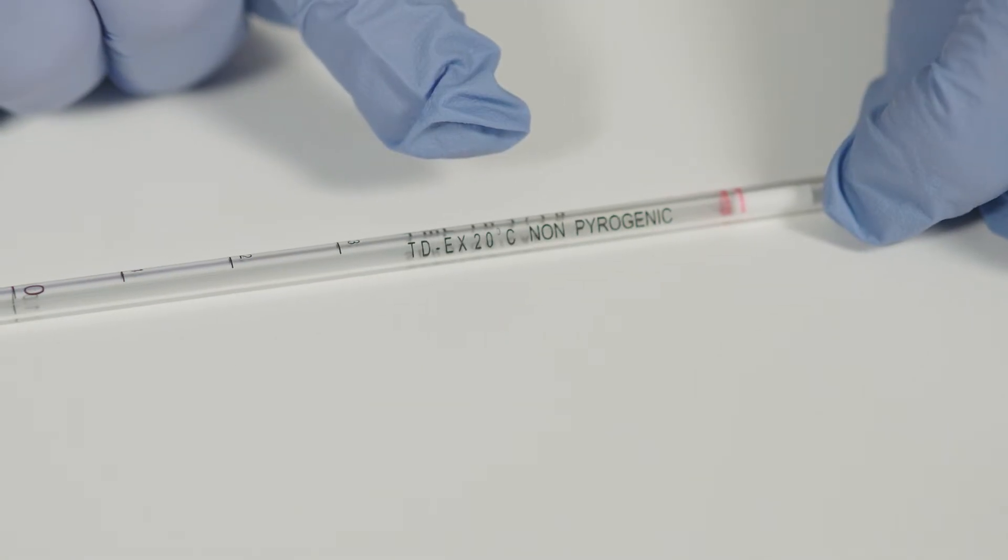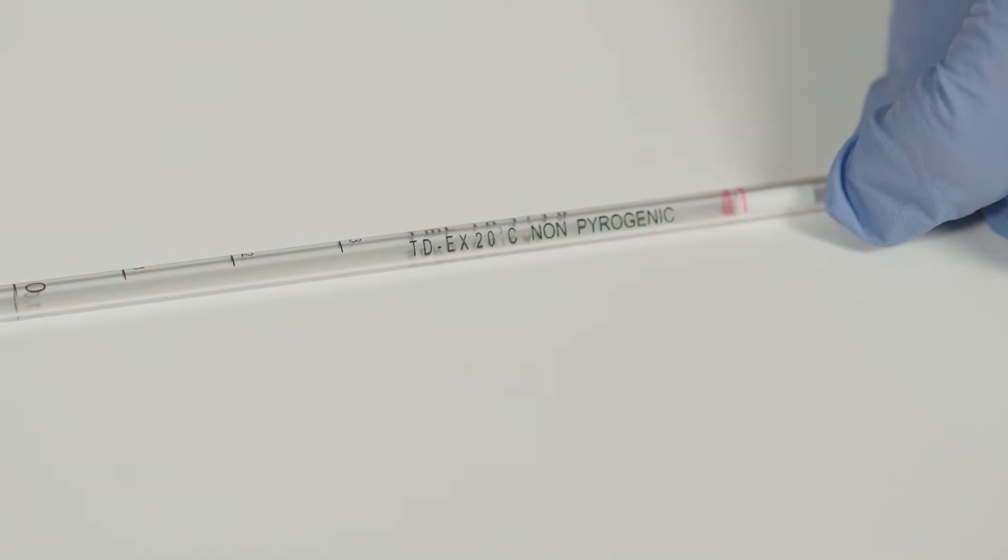You'll also see a temperature listed on the side of this pipette. That's the temperature at which the pipette would be most accurate and will tend to be standard room temperature.